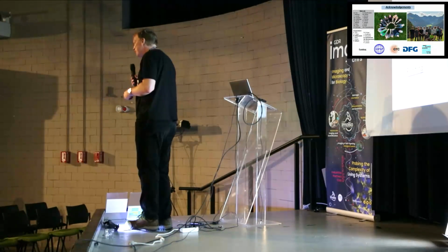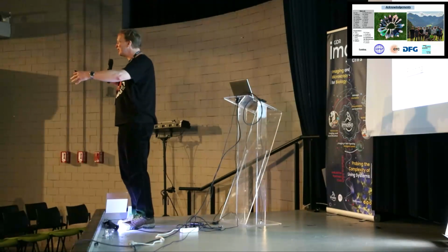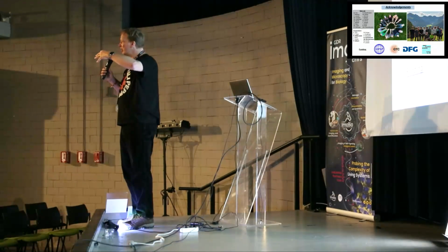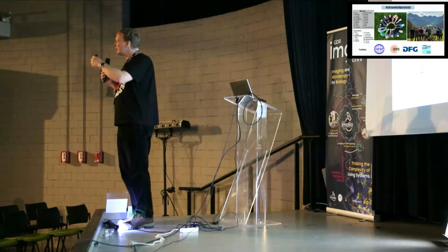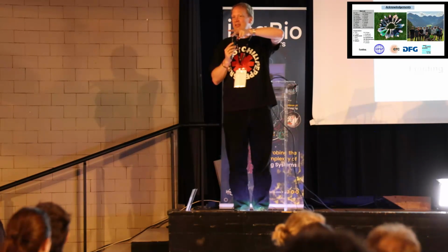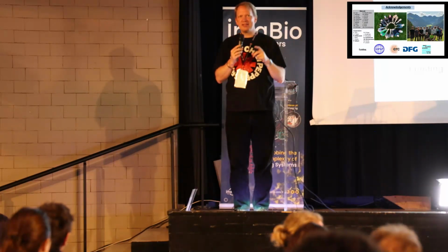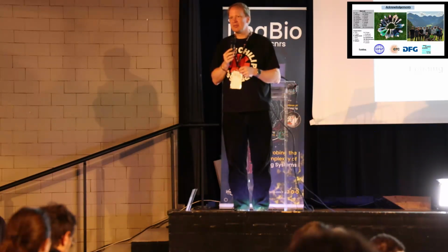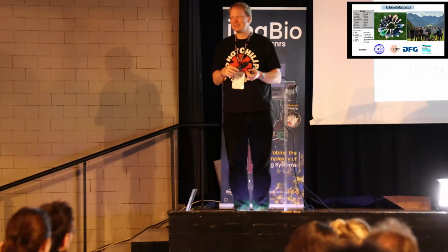Yes, you can, but we haven't done it yet. We're pretty much occupied by the inside. There is already some work on this, where people are looking at the yolk sac. It's, I think, much easier in that sense than the whole cells because it's not so dynamic, but there's quite some internal dynamic, as you say, in the yolk sac. There are some flows there too, and that is not so easy to model. So we haven't done it yet, but I think you're absolutely right. One should look at this. Thanks.